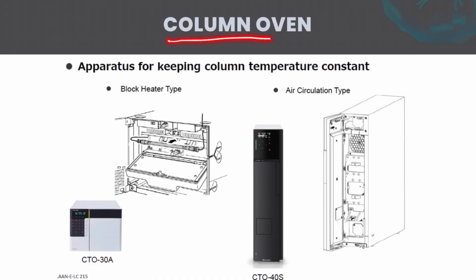Next topic is about the column oven. In order to enhance the efficiency of chromatographic separation, the column of the chromatography technique should be kept at a constant temperature.